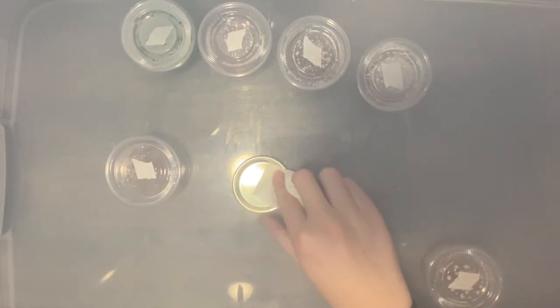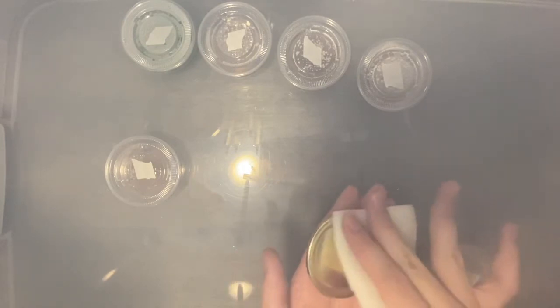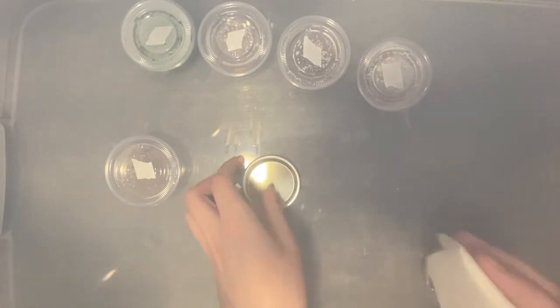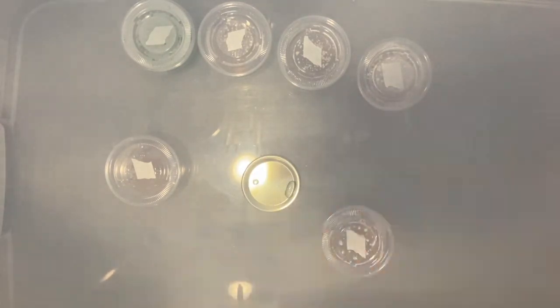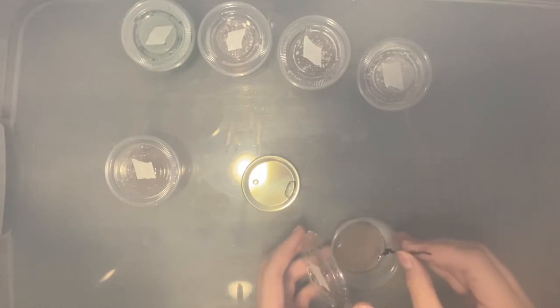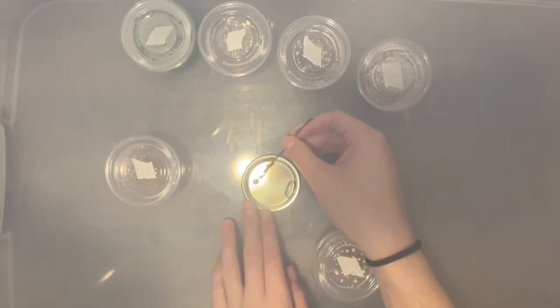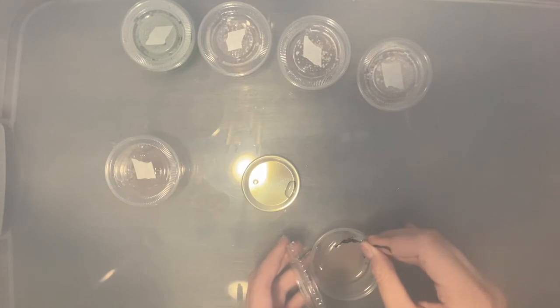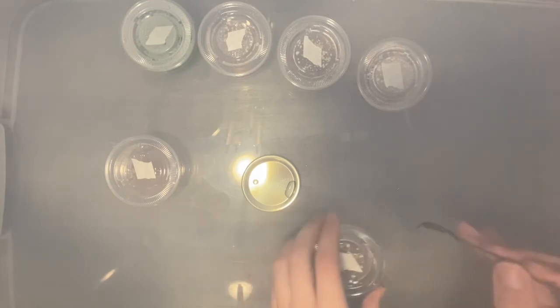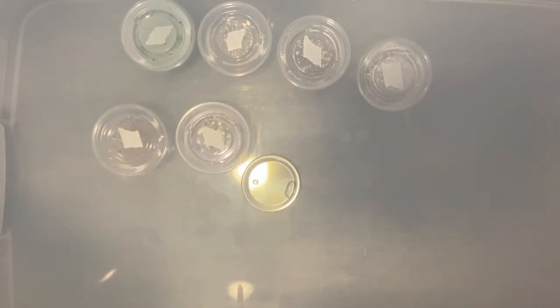Now we're gonna soak that up and get a new paper. Grab this and then wipe the top down. Okay, now we're gonna give that perfect. Now we're done with liquid culture and multi-spore syringe, so I'll see you guys whenever we're ready to do the spore prints.